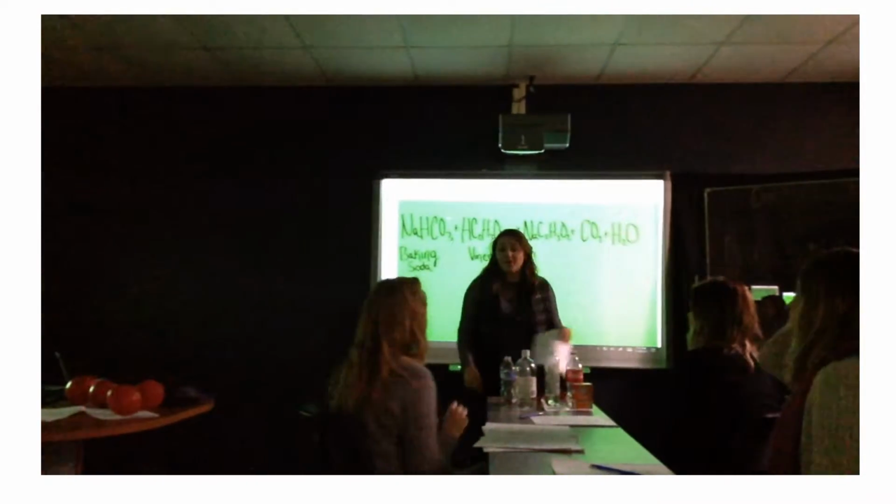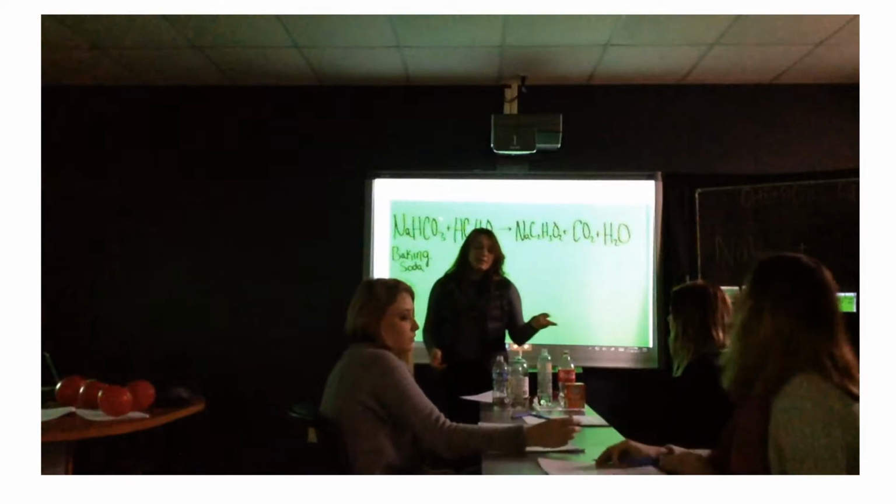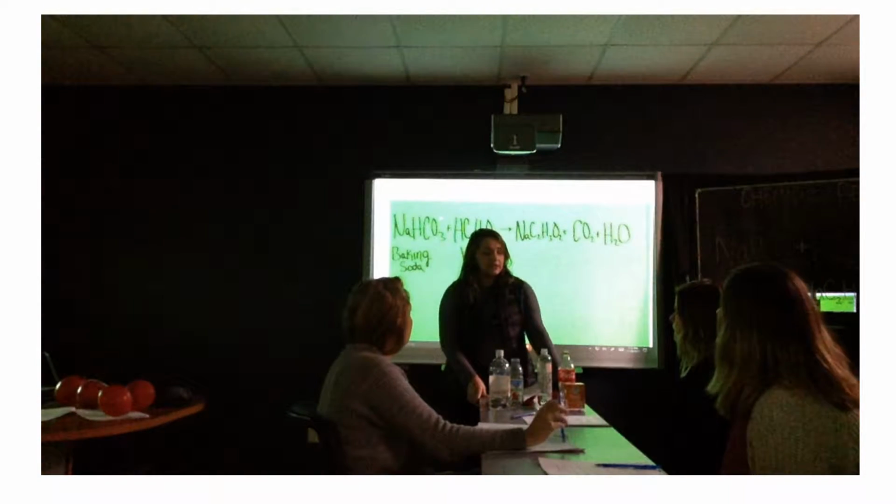All right, class. Today we're going to continue talking about chemical reactions. If you remember, we started talking about them last class. To experiment with this further, we're going to be looking at a reaction between two common household ingredients.